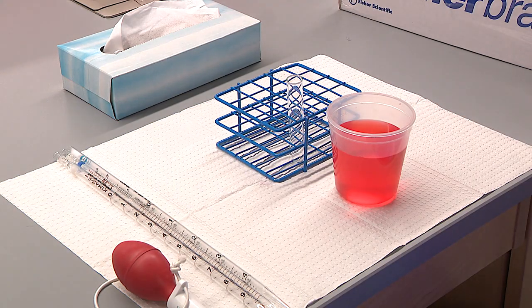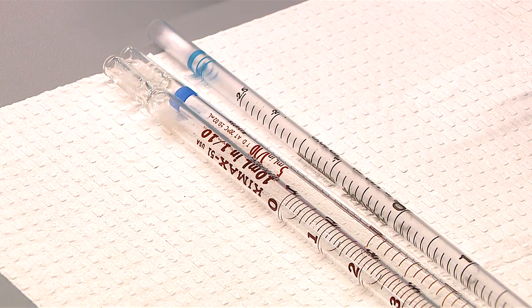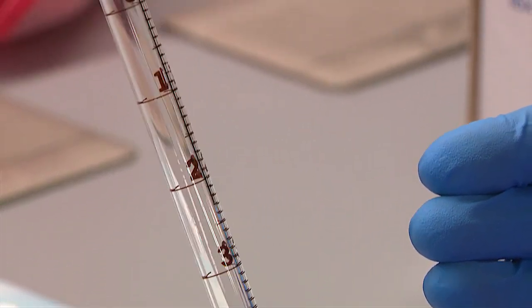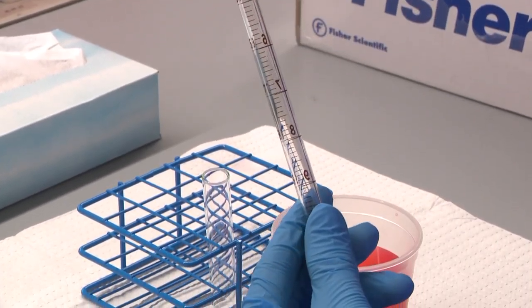In this video, we will demonstrate how to dispense a partial amount of liquid from a glass serologic pipette. For this example, we want to deliver 7 ml of red-colored water. So we will be using the 10 ml pipette. Pipettes can be plastic or glass. In this video, we will be using glass. Make sure the pipette is clean and not damaged in any way.